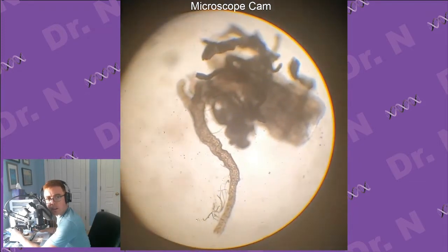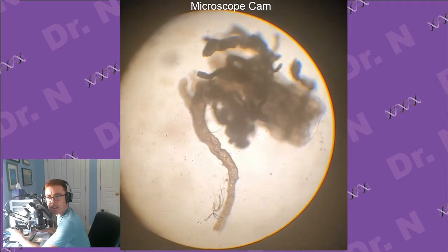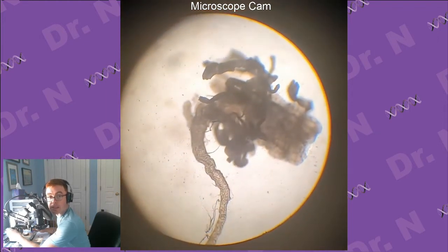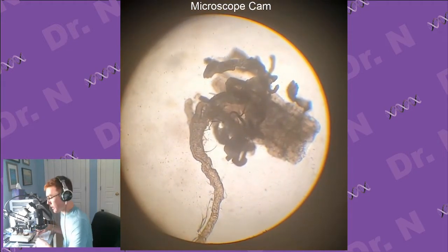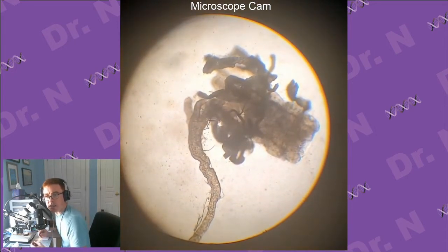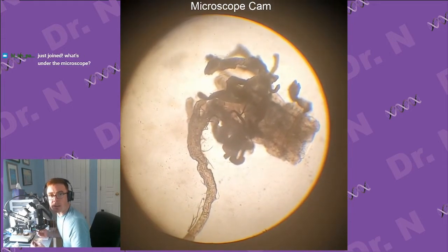All right, well, that looks like the mid-intestine. It's kind of like the right... it's been described to me as basically the stomach. So that's the thing on the left-hand side that looks kind of like a tube with tentacles coming out the top. I'm not actually seeing those salivary glands quite yet, so I'm going to keep doing some pulling.